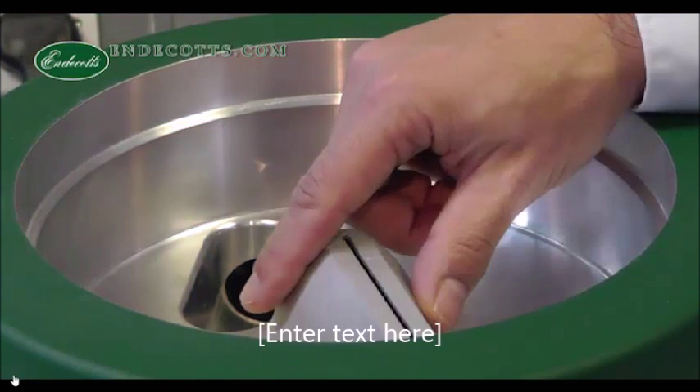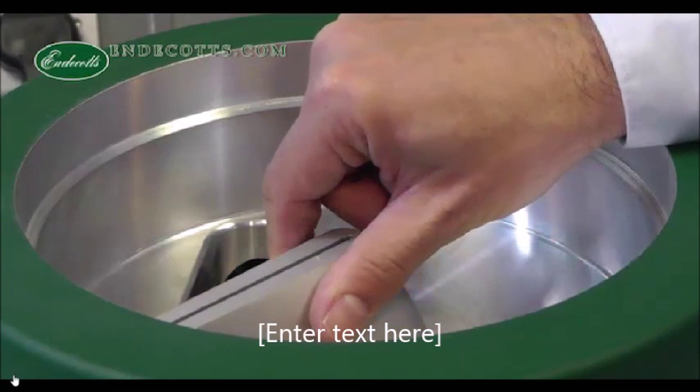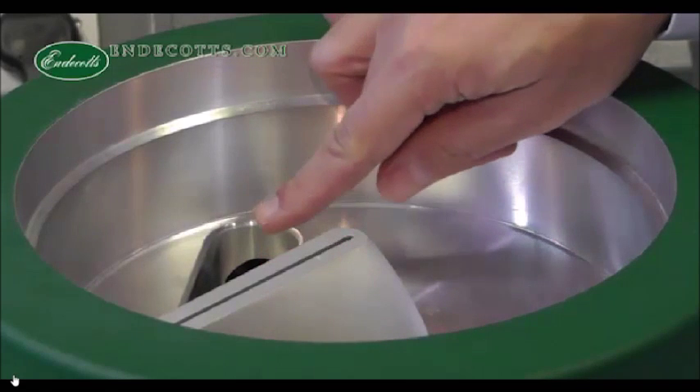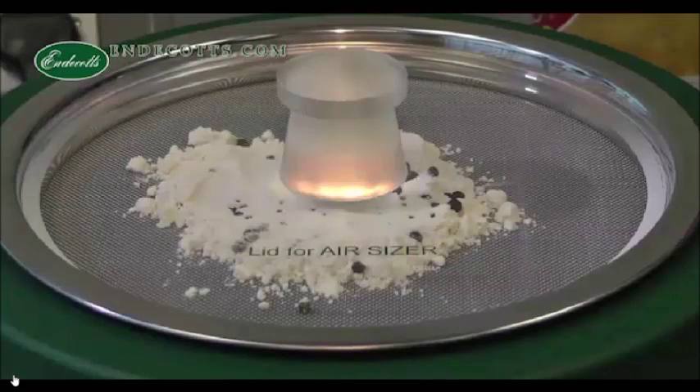Air is supplied by a rotating nozzle and disperses the particles on the sieve mesh. Directly after the dispersion, the air is caught by the air stream and sucked out of the sieving chamber by the vacuum cleaner. The oversized particles will remain on the sieve, and the undersized will be sucked through.